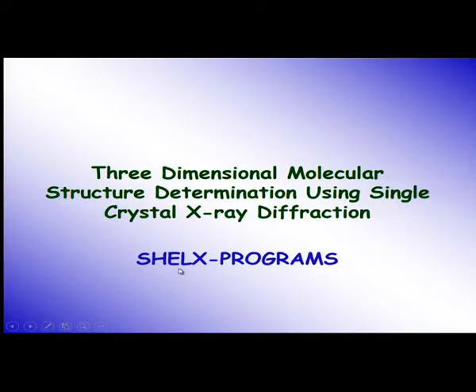Today we are going to learn about the three-dimensional molecular structure determination using single crystal X-ray diffraction. If you remember, in one of my presentations you have learned how direct methods could be used to determine the three atomic position of an atom constituting a molecule. In today's lecture we are going to see in detail a suite of programs called SHELX programs, which has been written by Professor George Sheldrick from Germany.